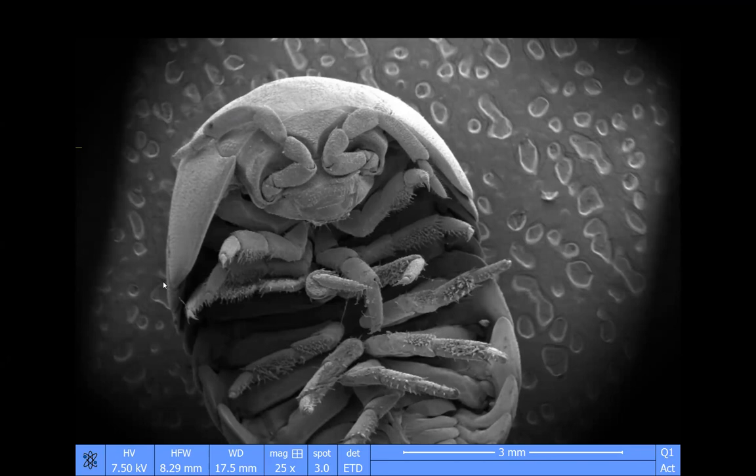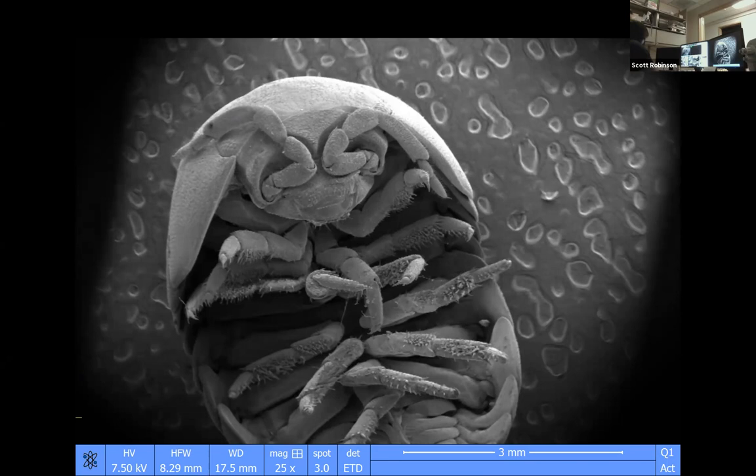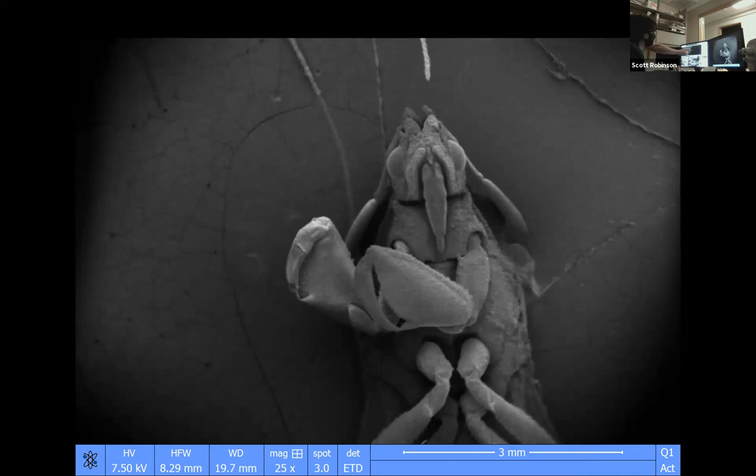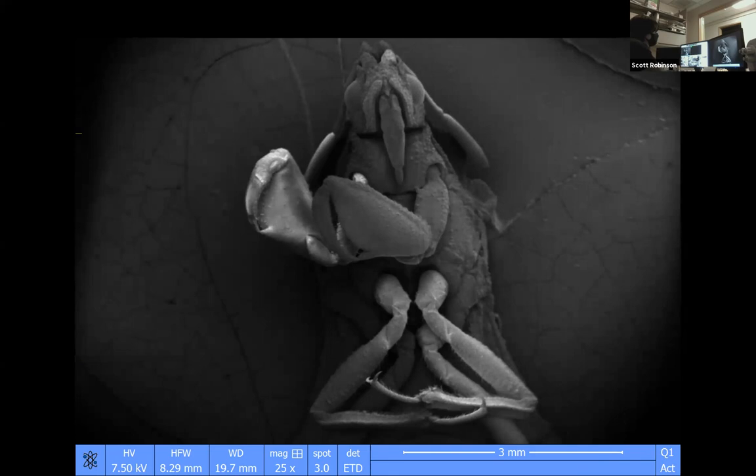So you're welcome to click on presets and drive around if you'd like to. You can click on any one of those things and just double click on it, and it will drive to that place. Ooh. Okay, and we just went by a really cool bee, and we came to an assassin bug. Ooh, this is an ambush bug. And so it has these really gnarly arms. So if you double click like right there, you can see that they have a retention device right there, which they can grab things, and they have like little sort of like thumb-like features on them.